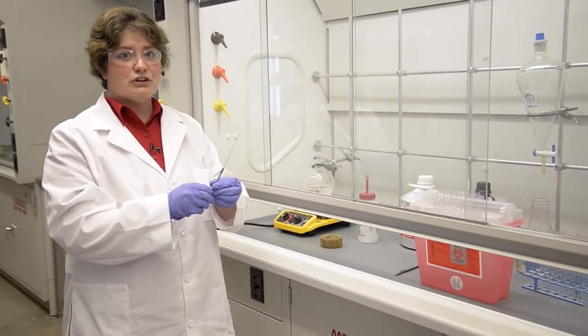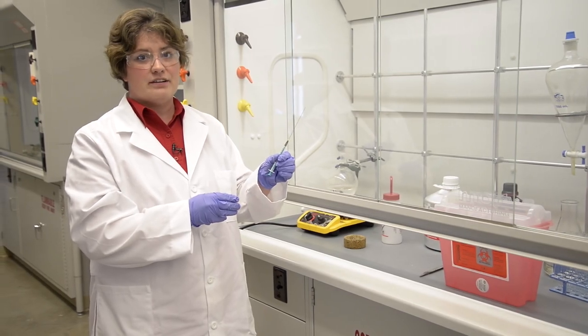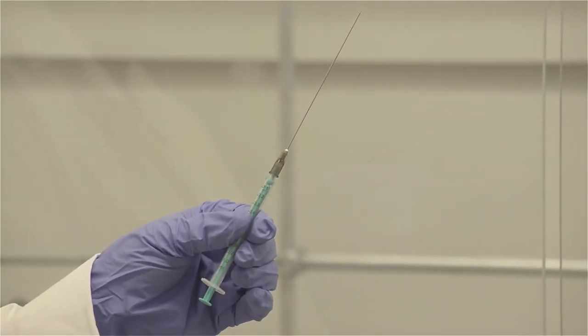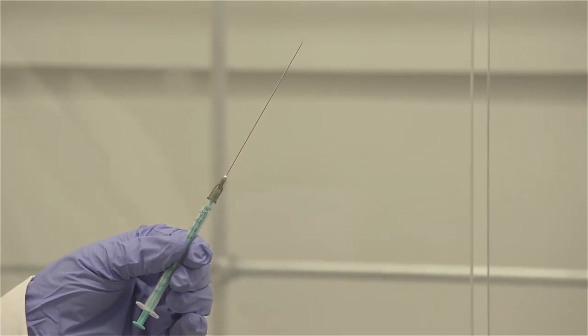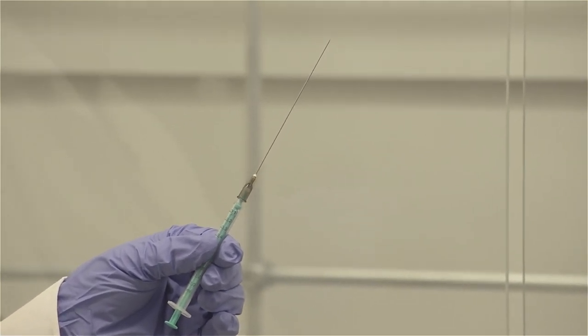Sharps is a general term that we use to reference sharp objects, such as syringes with needles, unsheathed razor blades, broken glass, or scalpels. These objects cannot be thrown away in the regular trash.